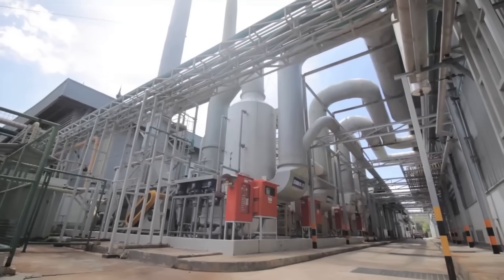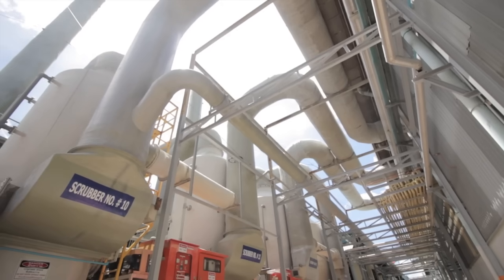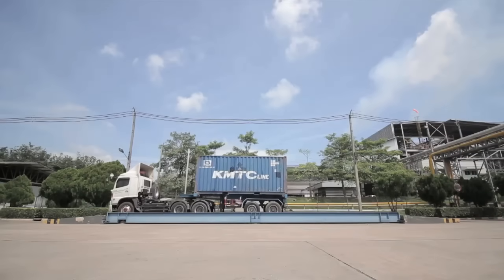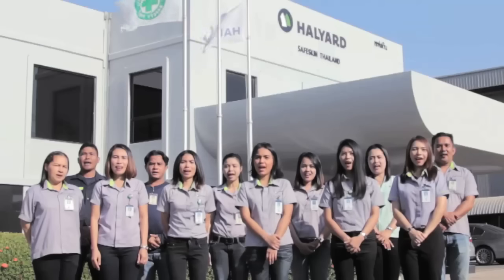The Halyard Pure Zero cleanroom glove manufacturing process is initiated when nitrile and other raw materials arrive at our safe skin plant in Thailand, are unloaded, placed in the warehouse and inspected every day in every way.